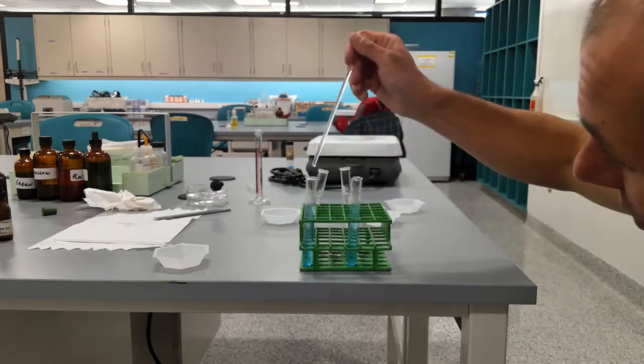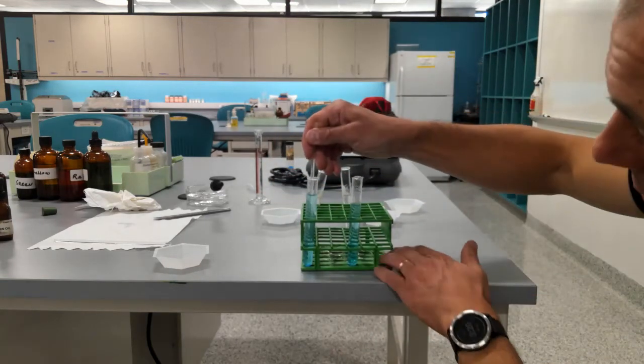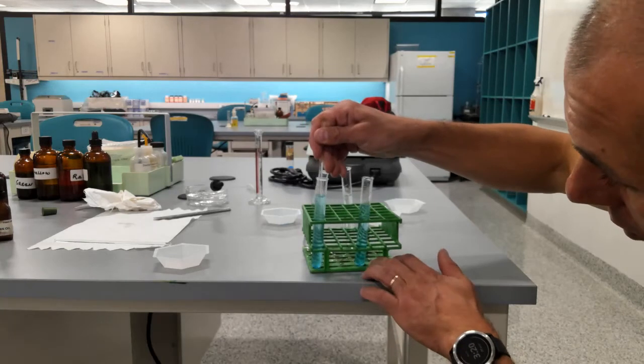The amount of precipitate is actually now a little bit larger in the cold water, which is not surprising.